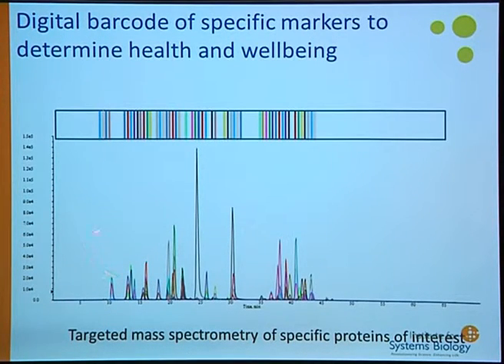And so in the end, you can come up with these things called barcodes. If you're interested in a suite of proteins that you want to measure in people's blood or urine or something else, you can create assays with well-characterized signatures of these peptides, and it can almost be seen as a barcode. As you're measuring those proteins in a particular sample, it doesn't even have to be a human sample, it could be any other sample.